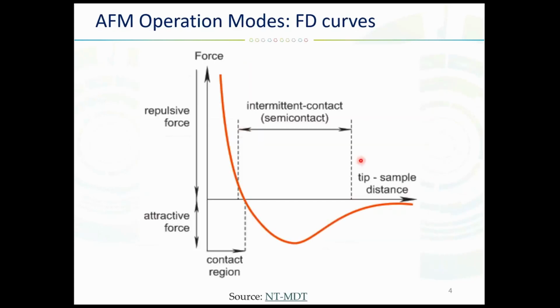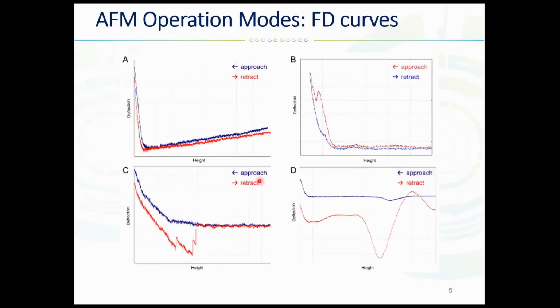Remember, this is the tip-sample distance. So this means that something is going wrong in this particular mode. To overcome these kinds of issues, people usually tilt the baseline and perform a procedure called baseline fitting. This will straighten this line at the right-hand part.